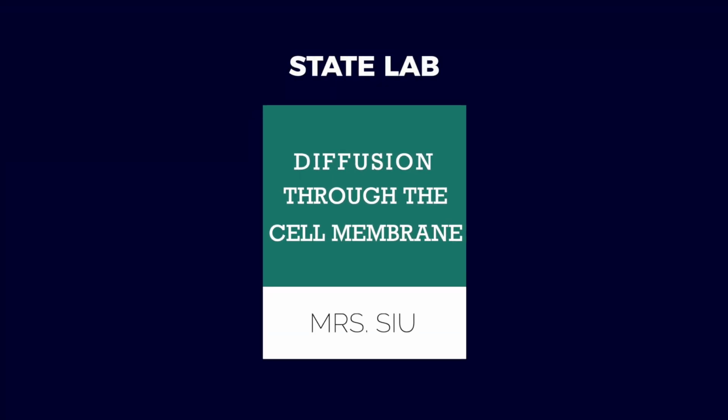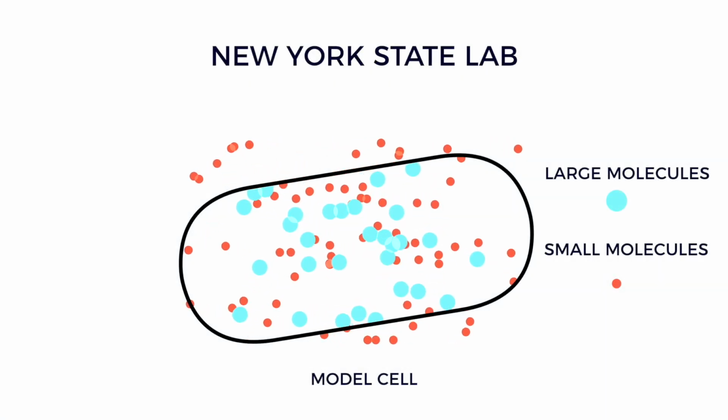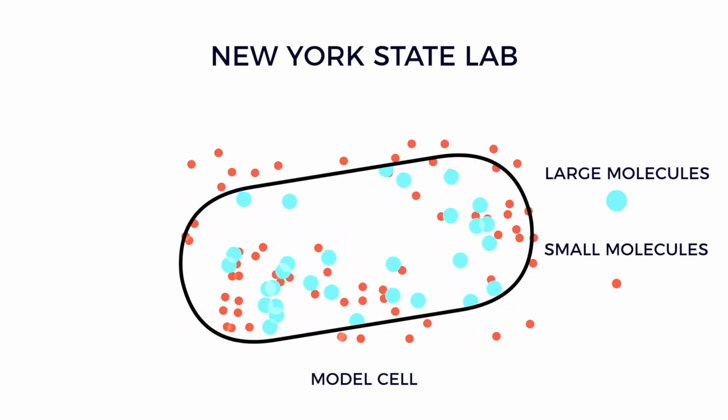We are working on the diffusion through the cell membrane state lab. This video demonstrates the first part of the lab, which shows diffusion. In this first part, we will build a model of a cell and observe the type of molecules that move in and out of the model cell.